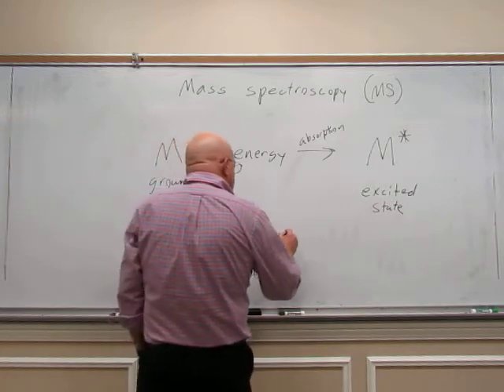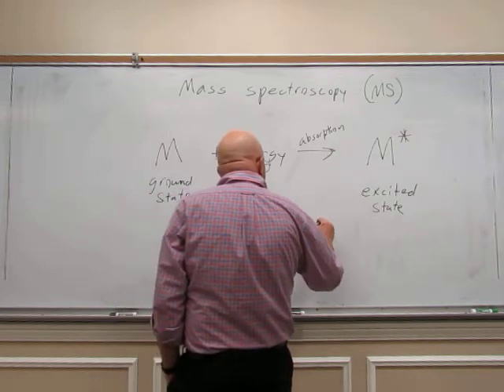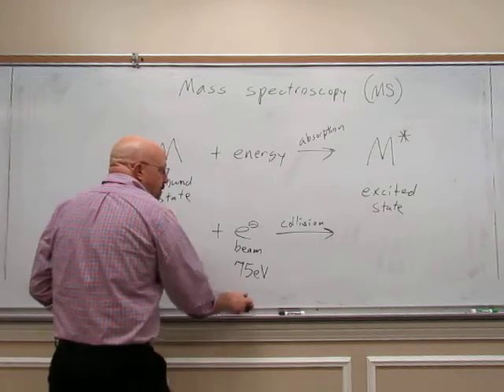That electron beam is going to collide with the molecule, and when it does, you knock an electron out of the molecule.